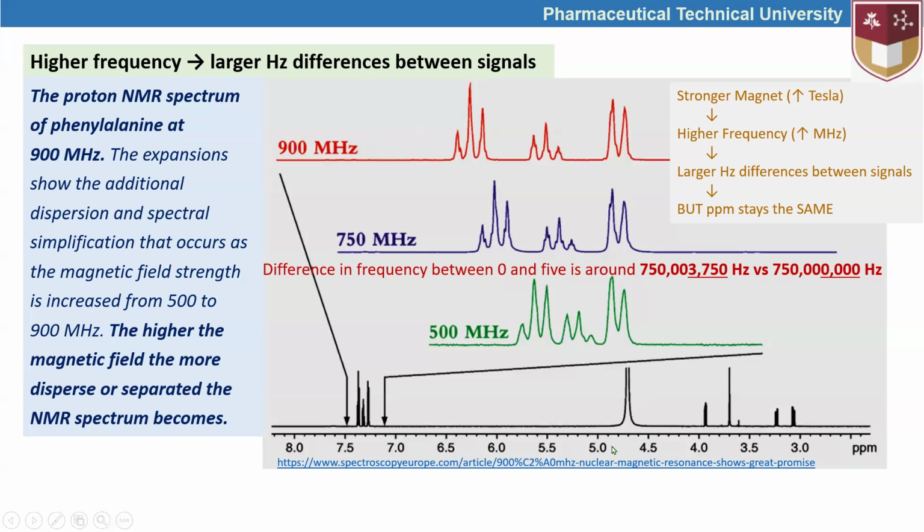We are going to talk about what these 1, 2, 3, 4 to 10 and 12 stand for, and I think I can give an explanation here as well. These are about the differences in the radio frequency. These are the numbers that belong to parts per million.